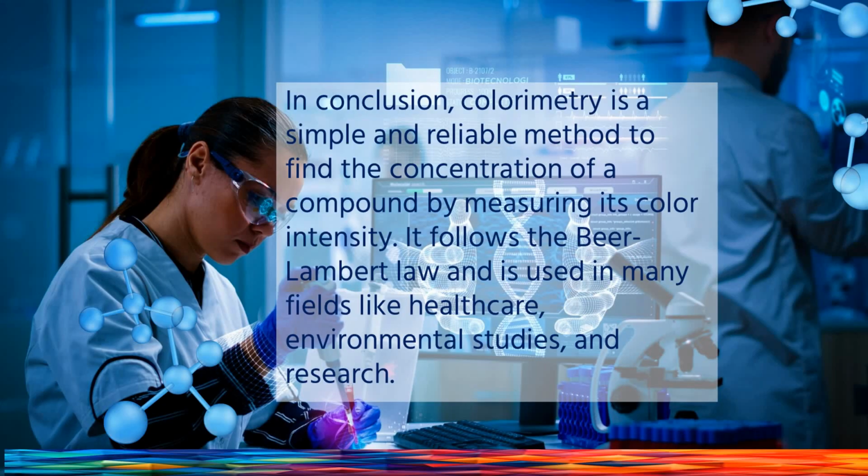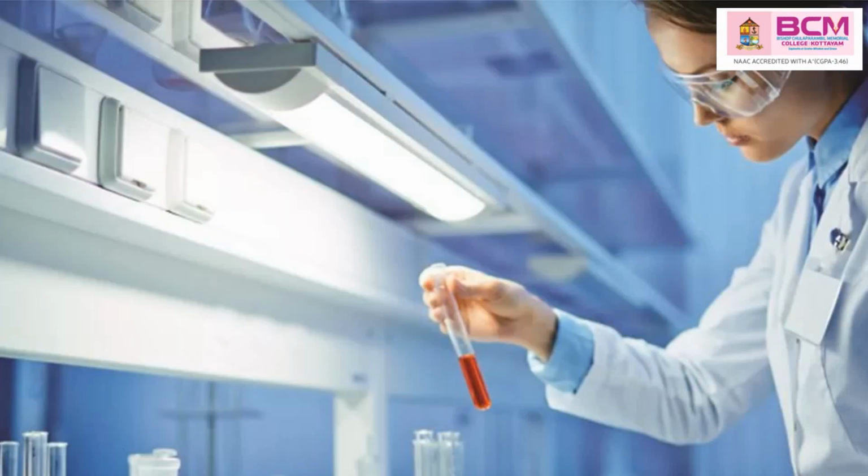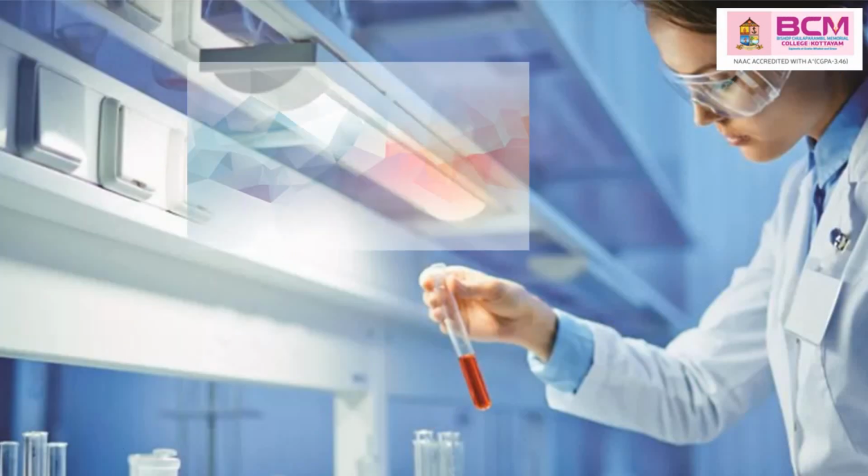In conclusion, colorimetry is a simple and reliable method to find the concentration of a compound by measuring its color intensity. It follows the Beer-Lambert's law and is used in many fields like healthcare, environmental studies, and research. Now let's conclude this short session on colorimetry.